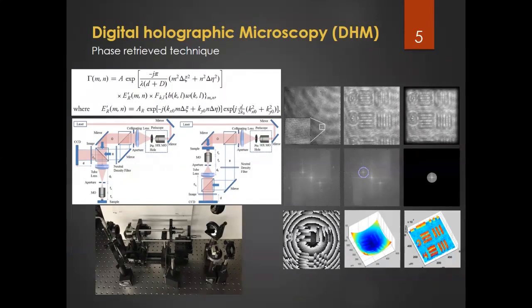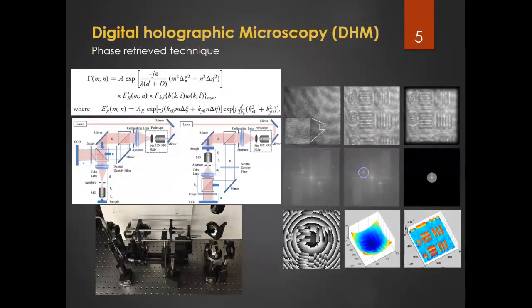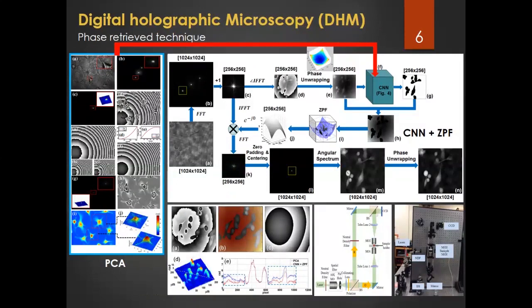However, manual segmentation is very time-consuming and requires a lot of time from the experts to do the fitting.